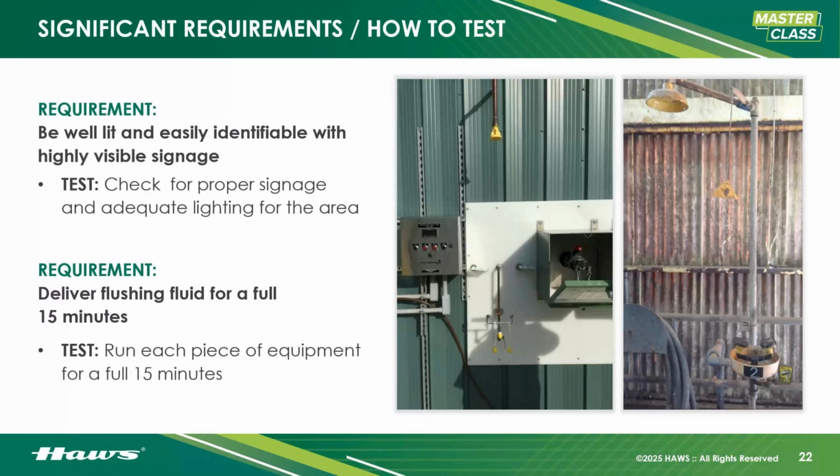This is so important because as first responders get to you, not only are they going to have to handle you, grab you, move you, right? But if that isn't off of you entirely, it's going to affect you all the way to the hospital. Okay, we want that stuff off entirely.